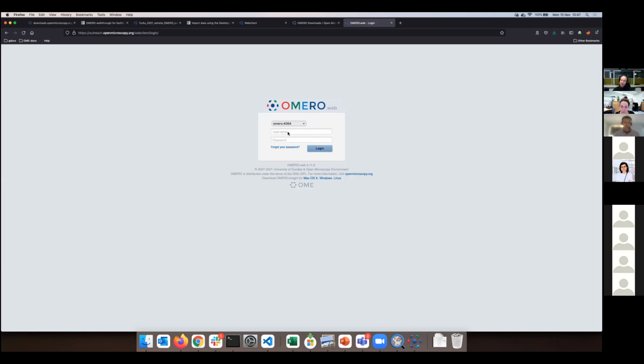So the Omero Insight is nowadays used mainly for imports. What I'm showing to you is a natural workflow. Albeit you might kind of protest. That's how it is. It is giving you quite a few advantages though, because being inside Omero Web, you will have the applications at your fingertips.